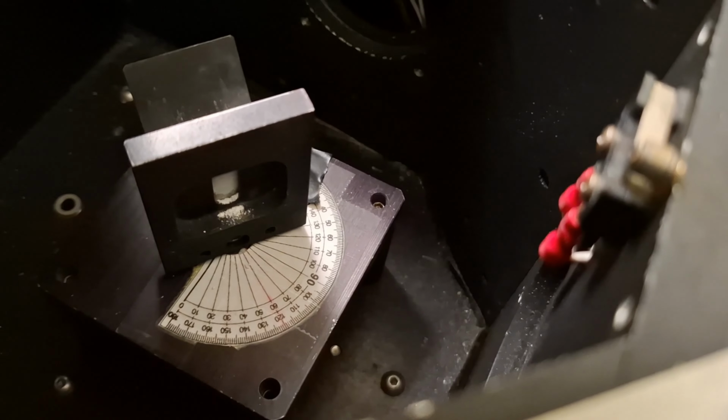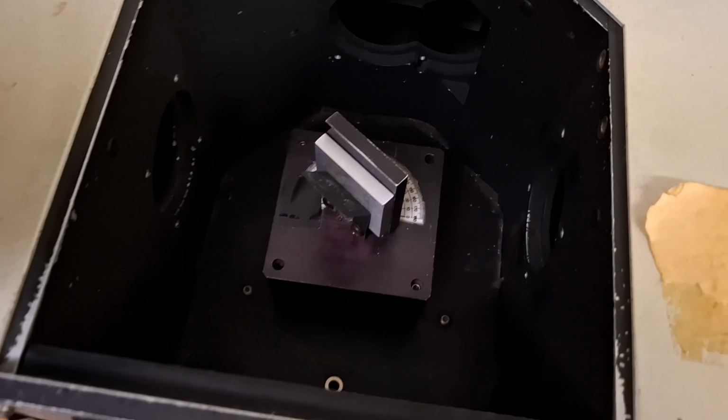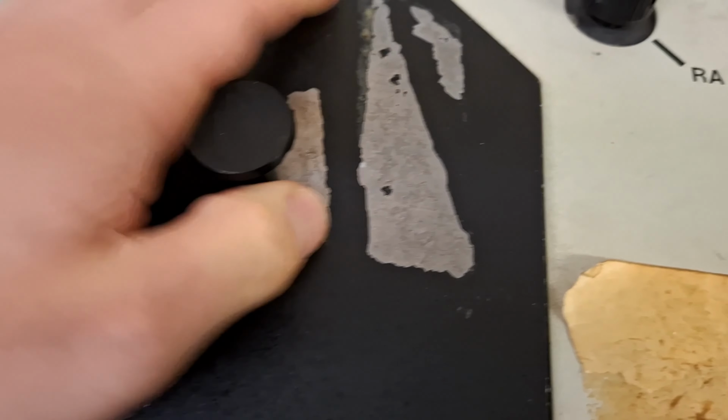There is also some powder that is going off from the sample, but it is not important. And I will close the lid. So I close the lid. I will also cover the surface with this black blanket.